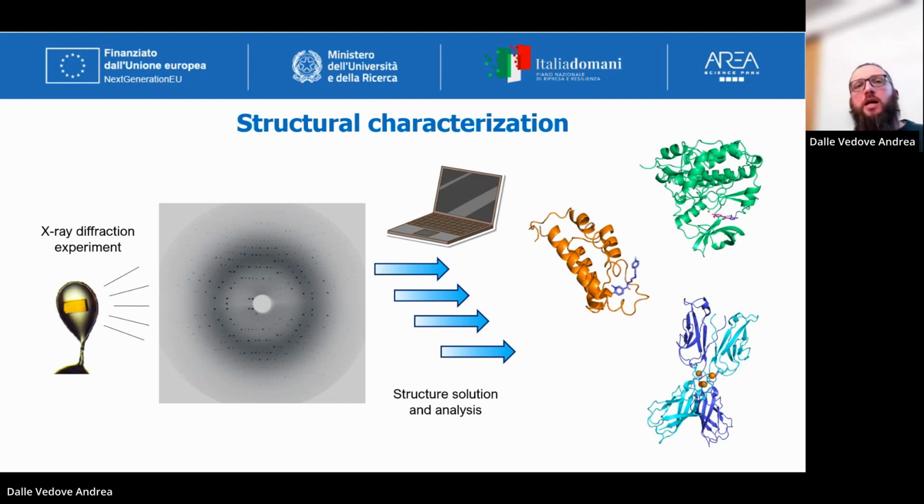We start extracting information from the structure we obtained, be it understanding how the mutation we put in, that we took from a pathology impacting humans, animals, whatever, be it seeing how the ligand we co-crystallized is interacting with my molecule. I will analyze the structure, extract this kind of data, and then move on with my project.